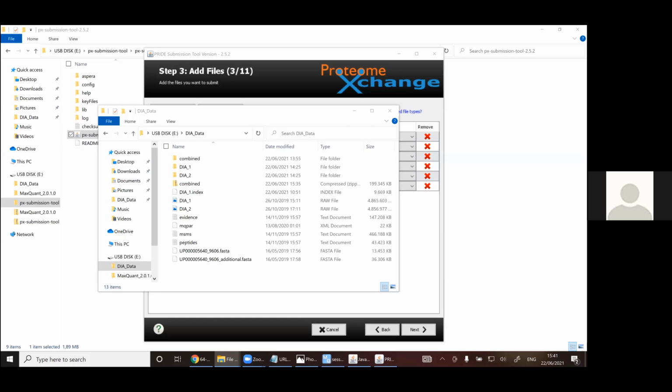Especially many people wrote Arabidopsis, unfortunately we didn't include it in the first trial. So we suggest for now to make it yourself, either using DeepMass, Prosit, or Winner. But we will try to really enrich our database of species, so not just the 10 species which we have right now, but more. But for now, as it is.